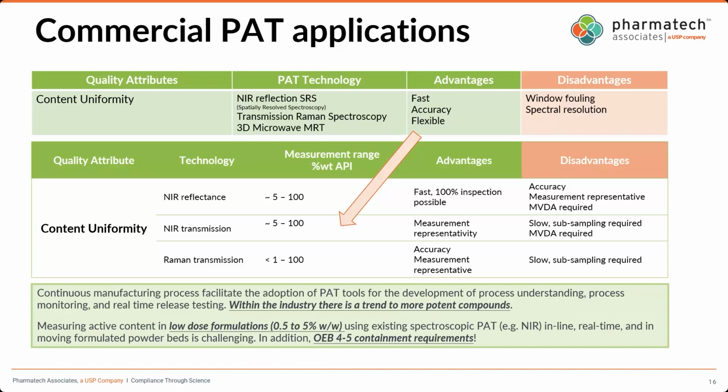Is NIR sufficient for this case? Is reflectance sufficient, or do you need transmission? So I think these are the questions which someone who needs to put this together has in mind and needs to overcome. And I think that's where the distinction should be, Richard, between doing R&D, research to identify the best PAT tool, and then when you transition to commercial manufacturing, you have to consider a lot of other factors. So you need a balance between the practicality and the operational aspect when you select the most suitable PAT.